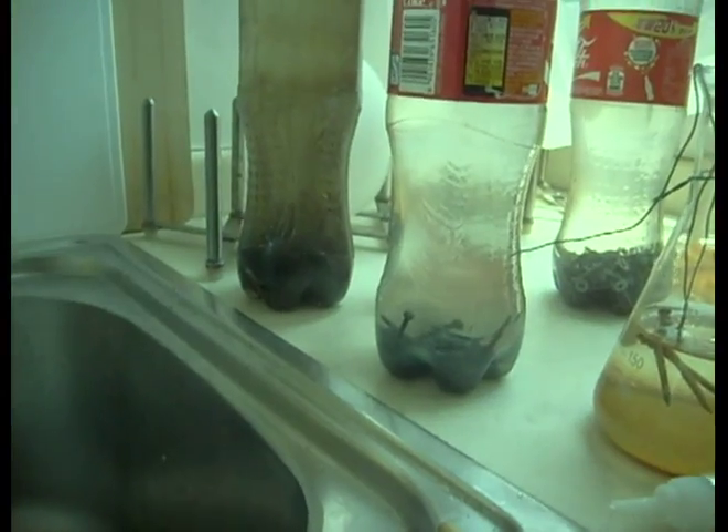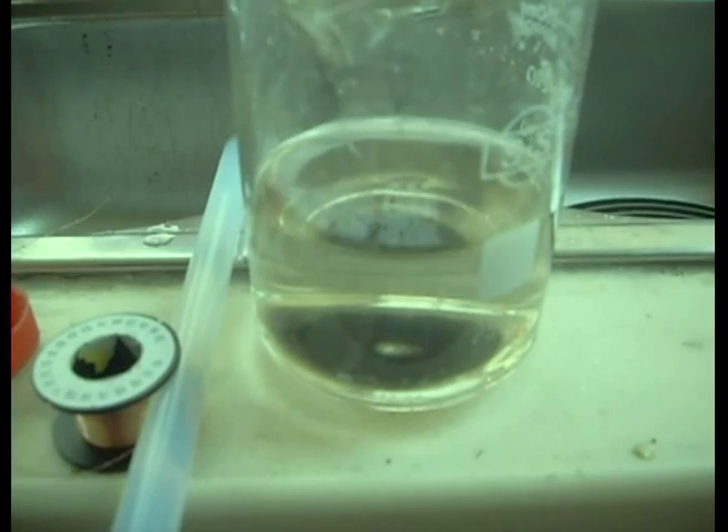As you saw before, I'm harvesting ferrite iron 2 oxide by using contained salt water bottles. And here we've got a pretty good harvest of this stuff. What we're going to do is we're going to play with some crystal methods of storage.